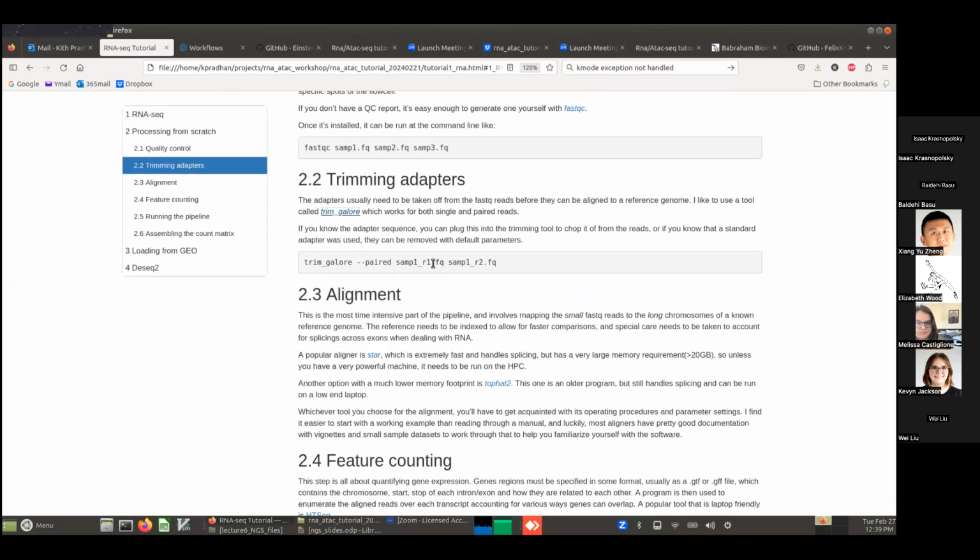Sometimes you might have fragments that are missing mates, or a fragment that just had low quality reads all along. So it'll filter out those bad quality reads, and the reads that don't have matching mates, and get you to a point where the data is in a somewhat clean state where you can do your other downstream processing.